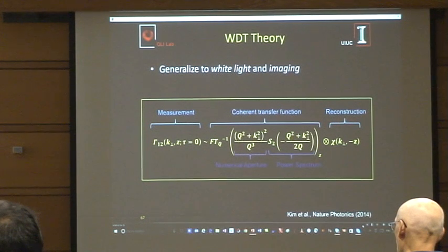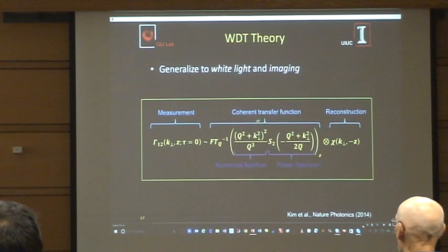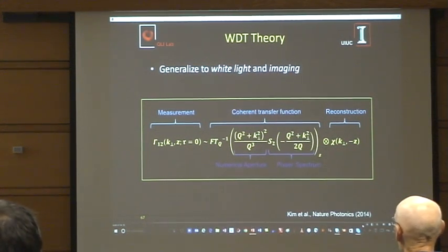Somebody elbows it, it goes away. So you have to align them within a micron, right? But in our microscope, actually, what interferes is the light that went through with the light that scattered off. So they are intrinsically in phase. And they are running out of coherence as the angles get bigger and bigger. That's kind of the idea of this formula, that the spectrum and numerical aperture are coupled.